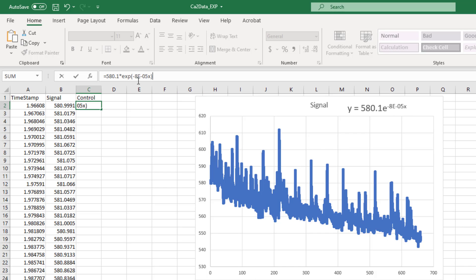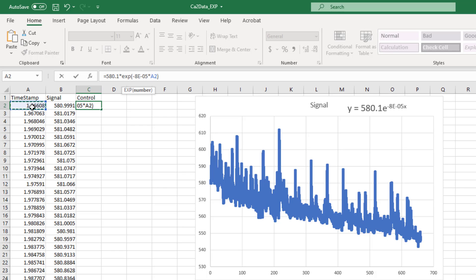This is going to take this exponential component of our equation here and it's going to use the exponential function in Excel to replace the E constant here. And then the other thing that we need to do is we need to replace the X value with our timestamp data, so again we're going to multiply by the timestamp.